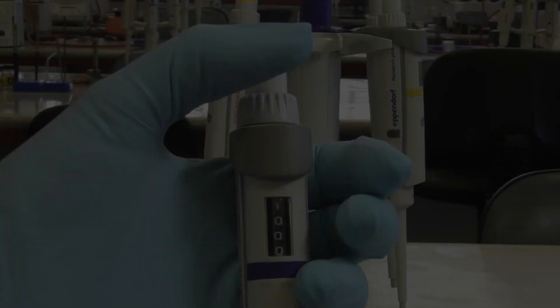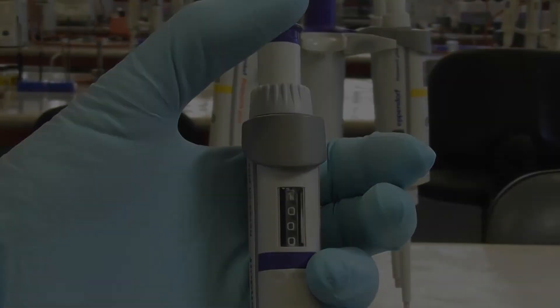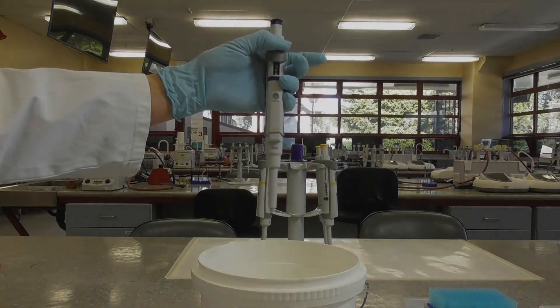To eject the used pipette tip, press the ejector button at the top of the pipette and eject the used tip into the waste bin.